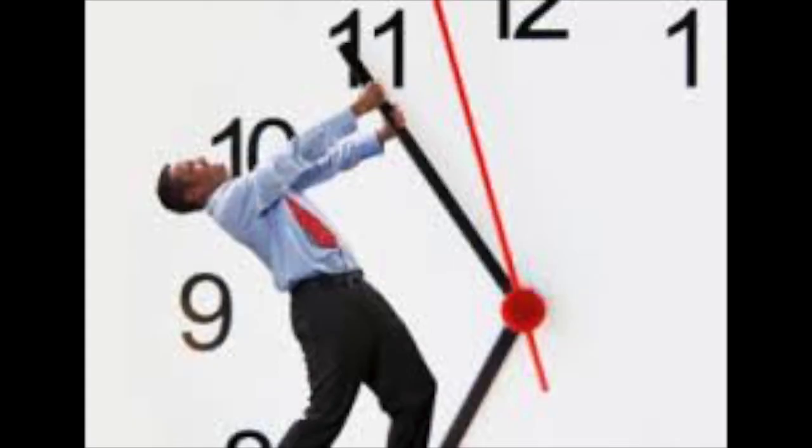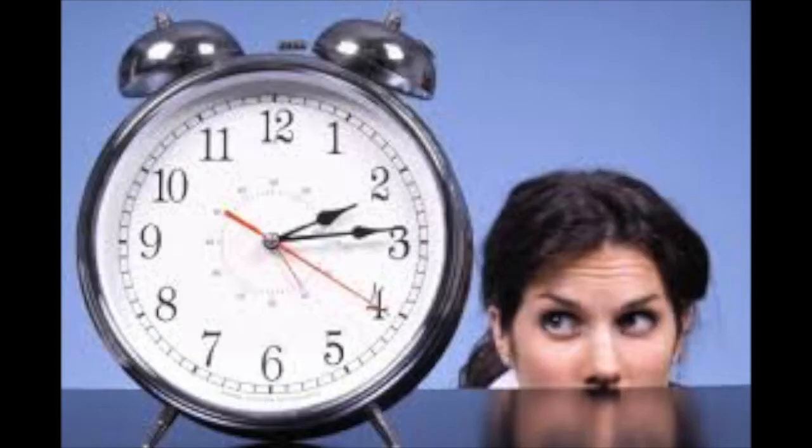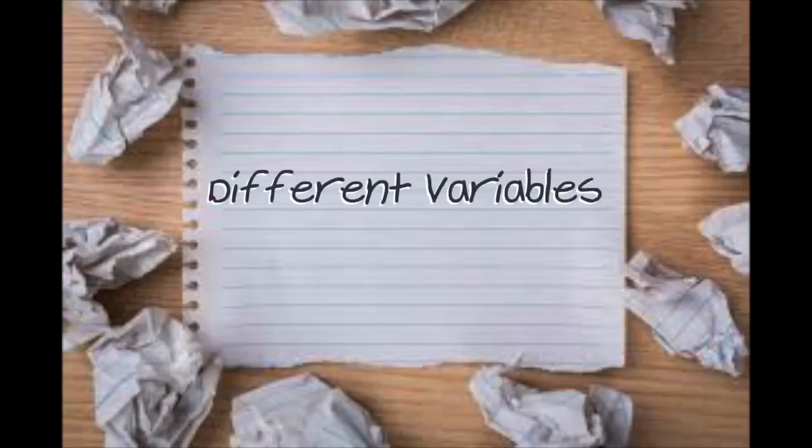We found ourselves fighting against the clock and having to do aspects of the lab at lunch to ensure we get done on time. So next time, I would seriously acknowledge the time and try the different aspects of the lab well timed to make sure that the lab is actually going to fit within a 75-minute period range. Another challenge we faced while making this lab was not realizing all the different variables that come into play once a lab is actually done.